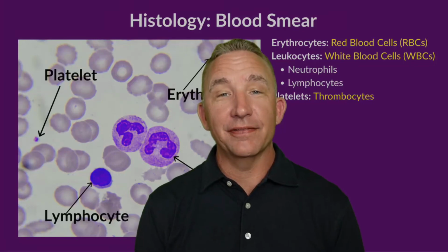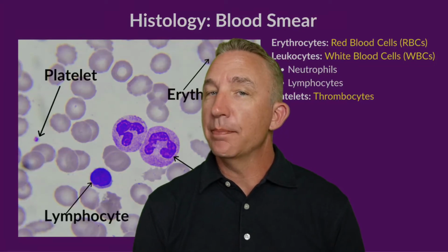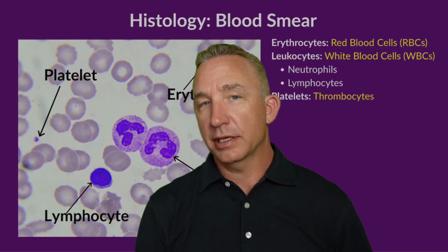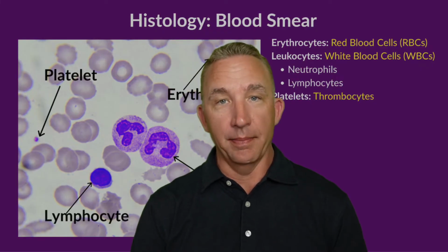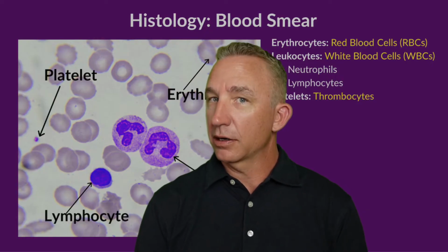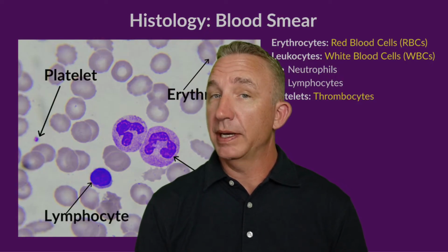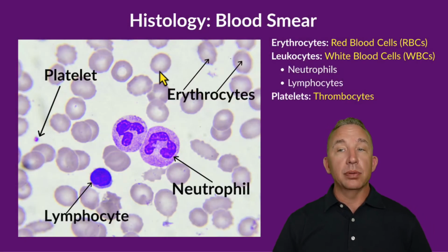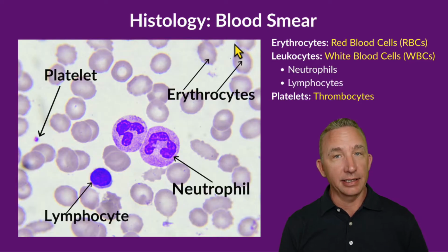We're covering the cardiovascular system and we're focusing on a blood smear, looking at blood. In previous videos, we looked at histology of the heart and the myocardium, that muscle tissue. We've looked at blood vessels, artery and vein, and compared the two based on how they are structurally different. And now we're looking at a blood smear and looking at a connective tissue.